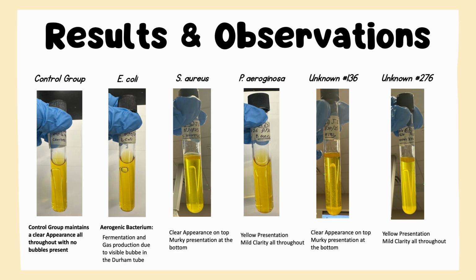I also want to address that the reason why there might be mild clarity all throughout is probably because we mixed, or shook the tube a little bit so that the bacterial growth can be dispersed all throughout, whereas the other ones where there is only a murky presentation at the bottom weren't mixed as much.